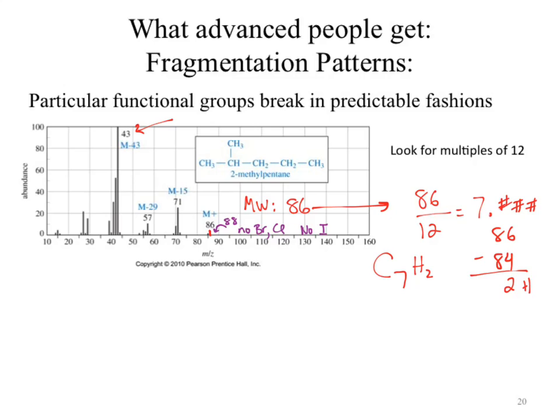Everybody okay with that part so far? Okay, why are you saying no? So are we okay with the math getting to this point? That's what we need to fix. Yeah. Okay. So we've got 7 carbons, 2 hydrogens. Okay. That matches the formula. That matches the mass. Everything about that says that is a possible formula. Except for the bonds. Is it a likely formula? No. Okay. So while this is still possible, it is a highly unlikely structure.